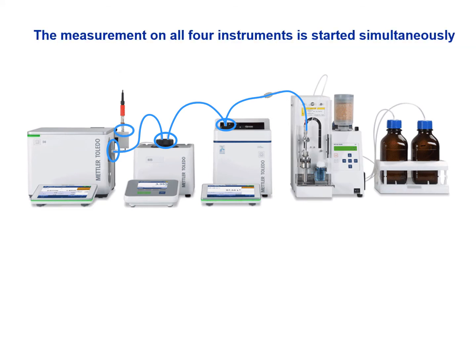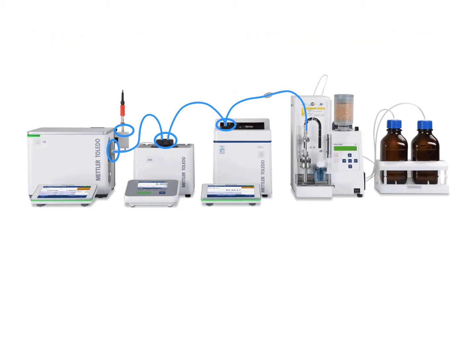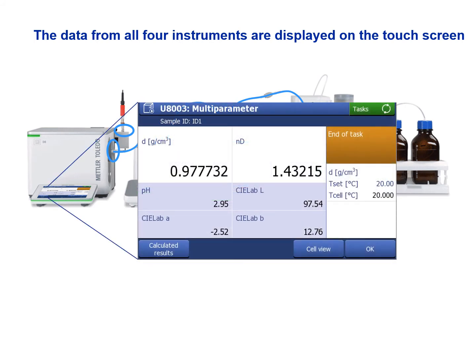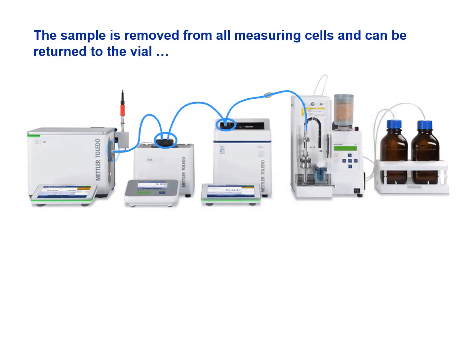The measurement is then started on all four instruments simultaneously. Once all the measurements are done, the data from the four instruments are displayed on the touch screen of the density meter, printed on a network printer, or transferred to the LabX PC software. The sample is then removed from all measuring cells and can be returned to the vial.